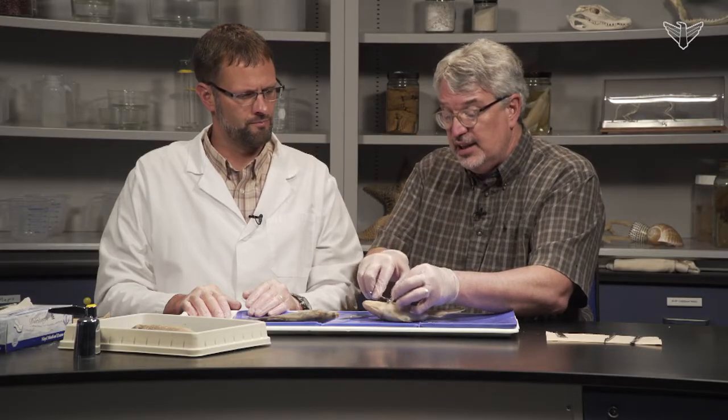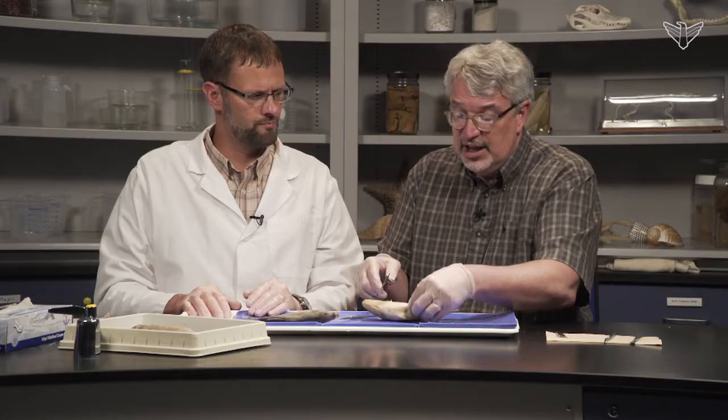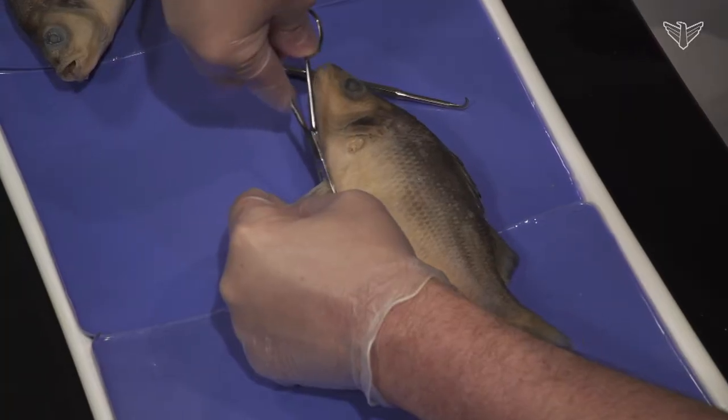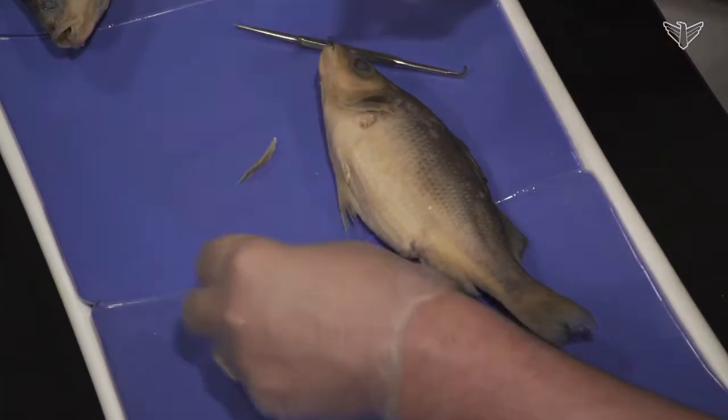I generally like to go ahead and take the pectoral fin off on one side so it doesn't get in the way, and you can even take a pelvic fin off on one side. You can definitely see that bone-like structure. Those spines — hit those pretty hard.